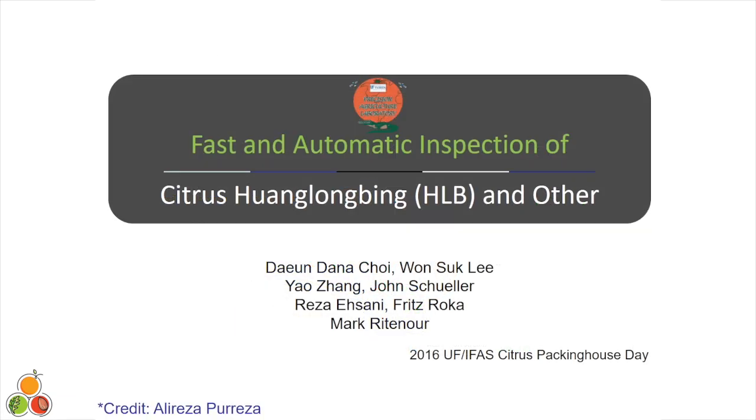First and foremost, and one of the biggest challenges in this field is the throughput. So this is one example of what is the throughput consideration. Just kind of the rule of thumb when we develop these techniques, depending on the size of the fruit, of course, but the throughput is between 40 up to 400, in that range, items per second.